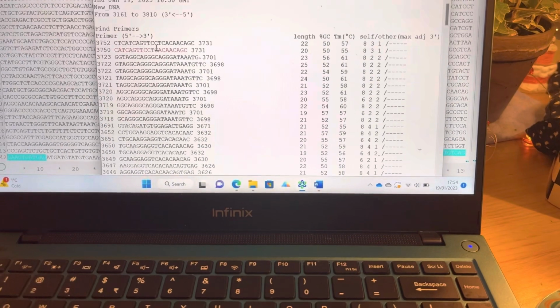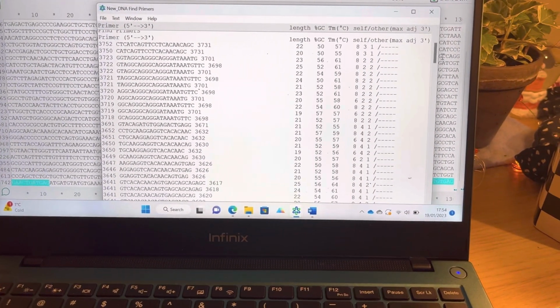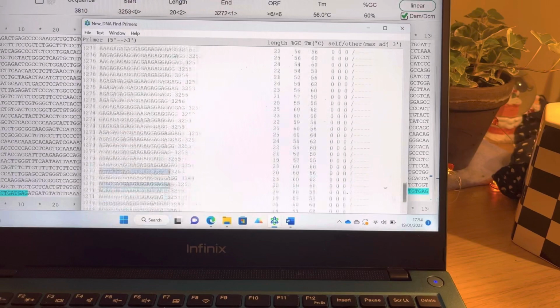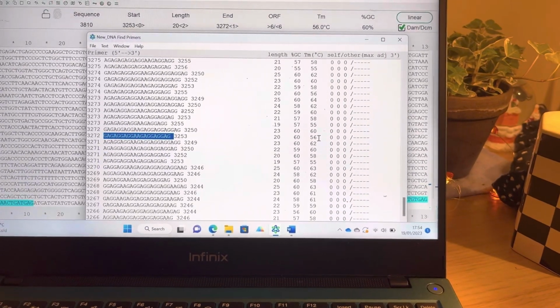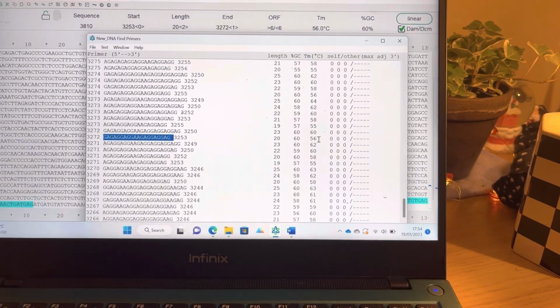Go again to this drop down that was earlier reflected, and you go downward somewhere. Now it's very important to keep this one thing in mind, that the difference in the TM value of the two primers, that is the forward and the reverse primer, should not be more than 5 degrees Celsius.